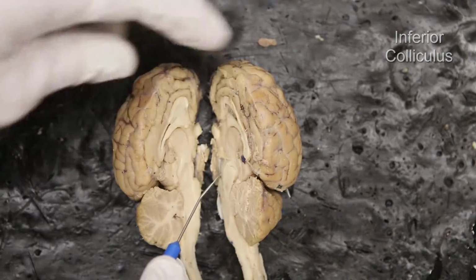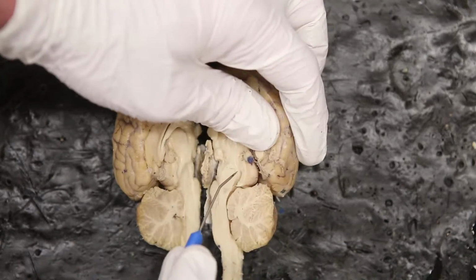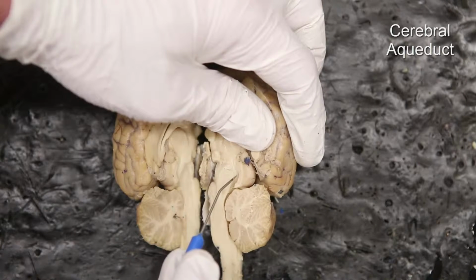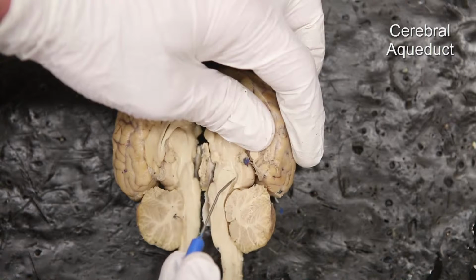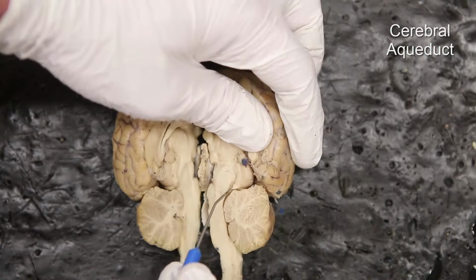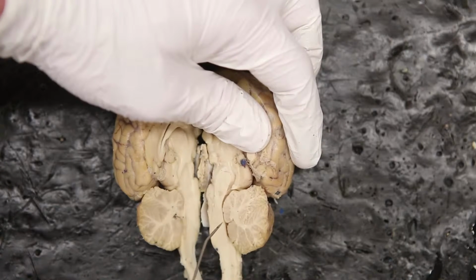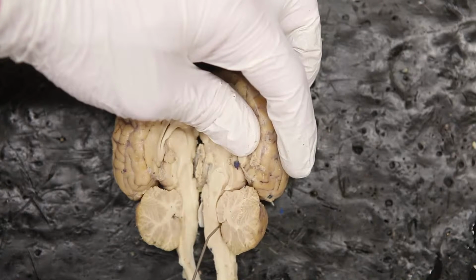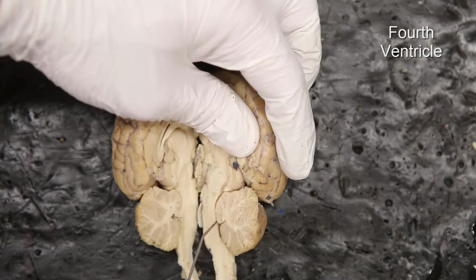If we go just under that, right here, this opening is the cerebral aqueduct. We can also see in the same region this little triangular space right here. This is the fourth ventricle.